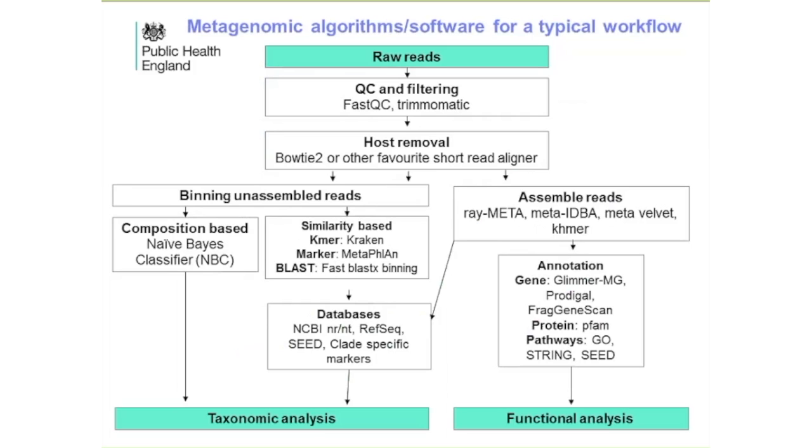These are the methods that we have used for comparing the sequence data, genomic data from raw read QC for those using these methodologies. I just wanted to share with you which software we have used for each step, from quality assurance down to separating the groups of organisms and putting the sequence data against the various reference sets.